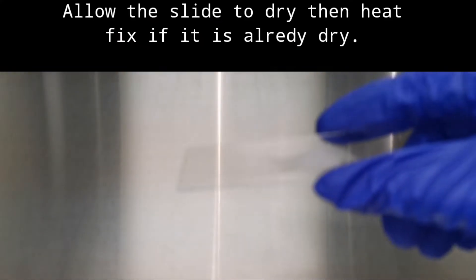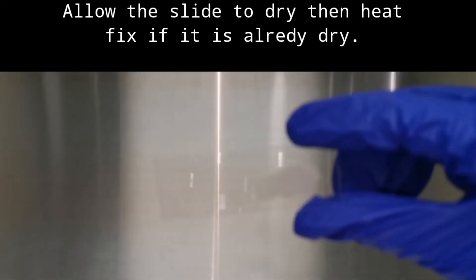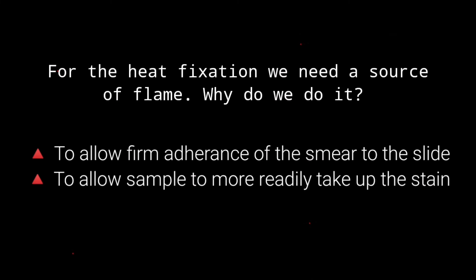Once the slide is dry, we do the heat fixation method. For heat fixation, we need a source of flame. We do it to allow firm adherence of the smear to the slide, so the sample sticks well and won't come off during staining. The second purpose is to allow the sample to more readily take up the stain.